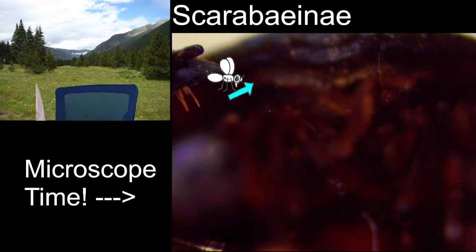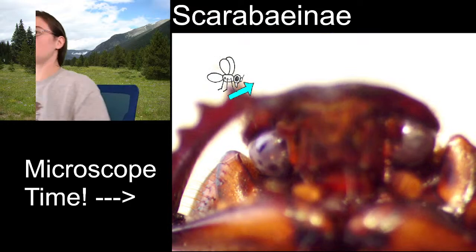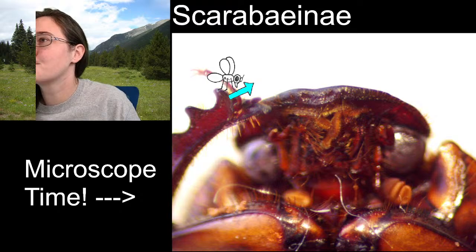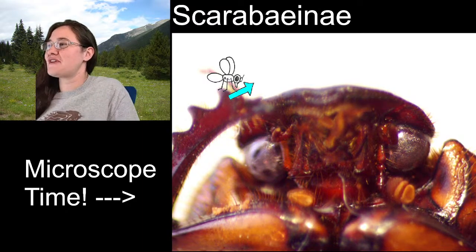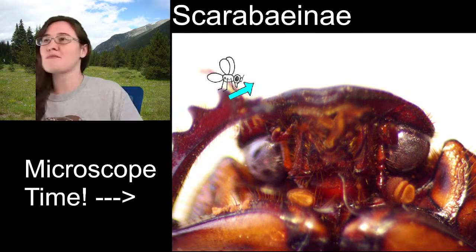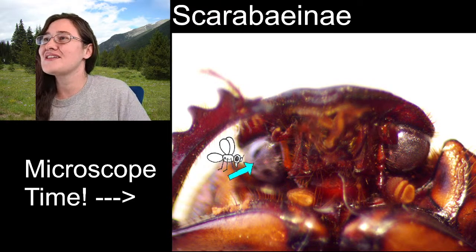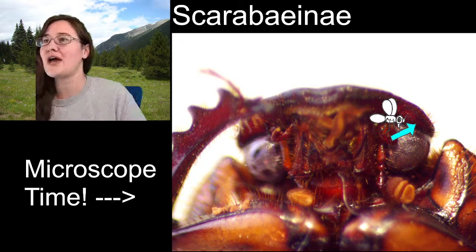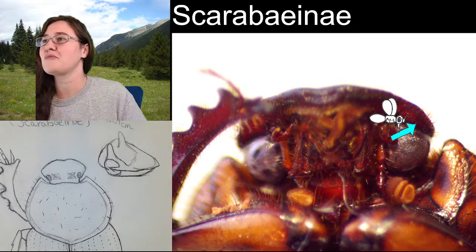Look at how cute. All right. I don't know how much of the individual mouth parts we're going to be able to point out. But here are some of the things I can show you. These are the compound eyes of our specimen underneath the shelf here, just like we had seen before when we looked at it from above and from a lateral point of view.